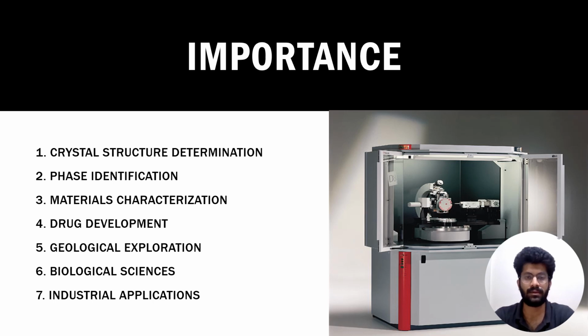X-ray diffractometers allow us to study the physical and chemical properties of crystals at atomic scale, given the fact that many materials we find around us have crystalline nature, like semiconductors, salts, other organic and inorganic molecules, or can be crystallized using the crystallization process. This becomes of paramount importance in understanding the underlying crystal structure. We can extract the properties of yet unknown crystal materials as well.